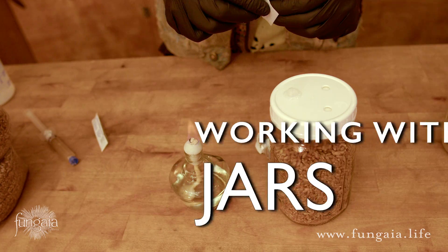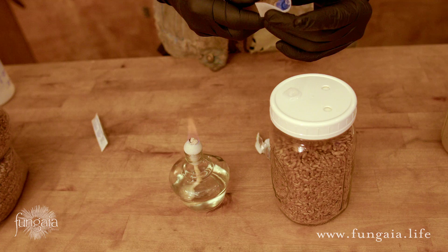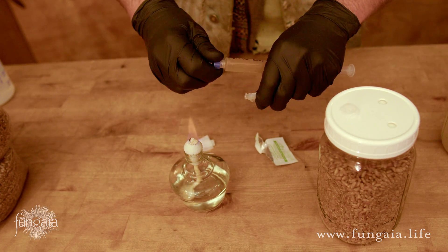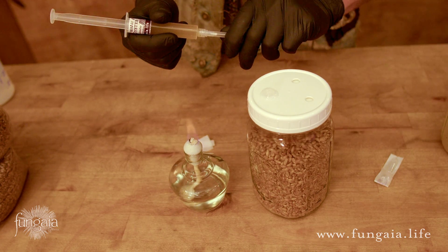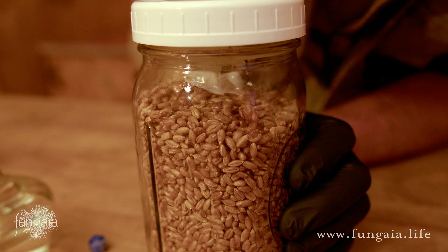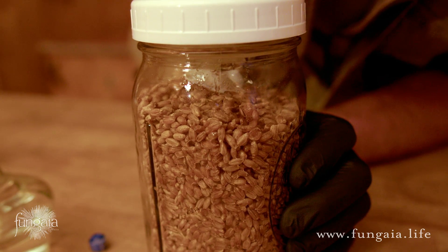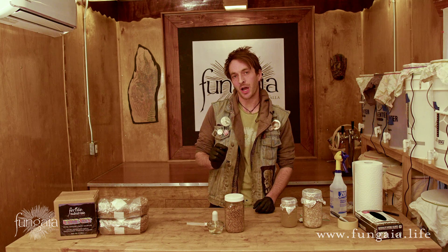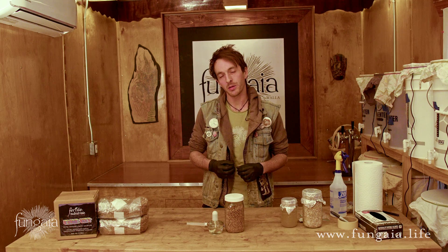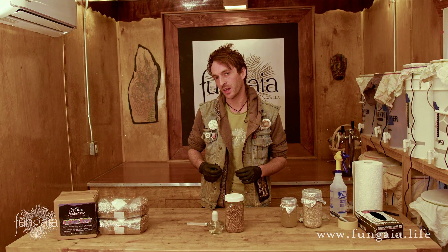Start by wiping down the injection port, the syringe, and your fingertips using the 70% isopropyl alcohol. Peel open the needle first, then take off the cap from the syringe and screw the needle on. Slip the cover off, then gently insert the needle through the injection port and squeeze the liquid culture into the grain. A single syringe can inoculate 5 to 10 whole pounds of grain. You may be tempted to stretch it, but the more you use, the faster and more effectively it will grow. In theory, a single drop of liquid culture would eventually grow to fill the entire jar, but it'll take forever and problems are far more likely to arise during that time.